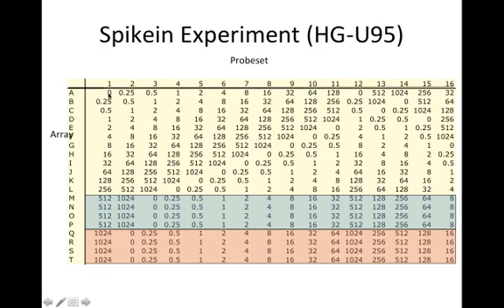So the other thing we can also do is compare probe sets to each other, right? So we can see if probe set 1 and probe set 2 are actually increasing. So it's a very nice design. It's been very useful for development of methods for data analysis.